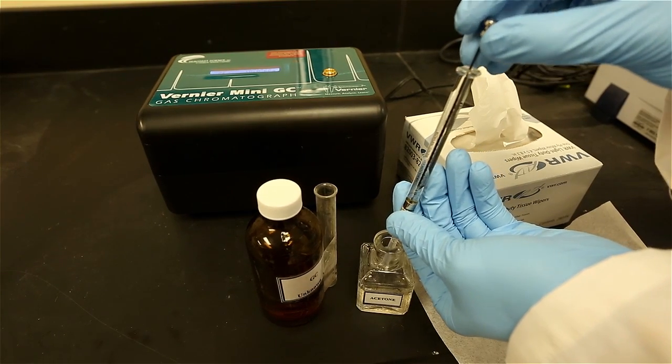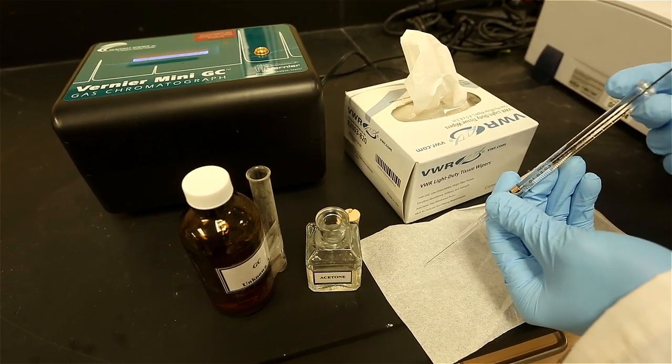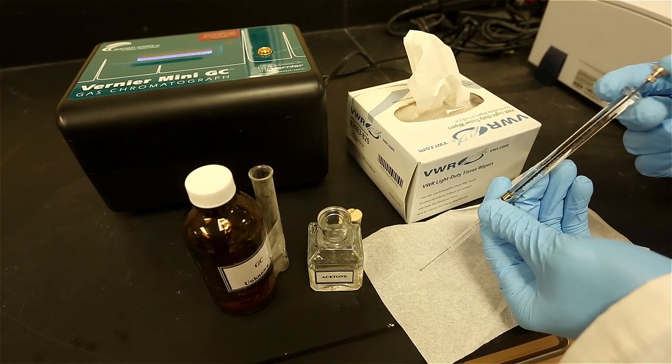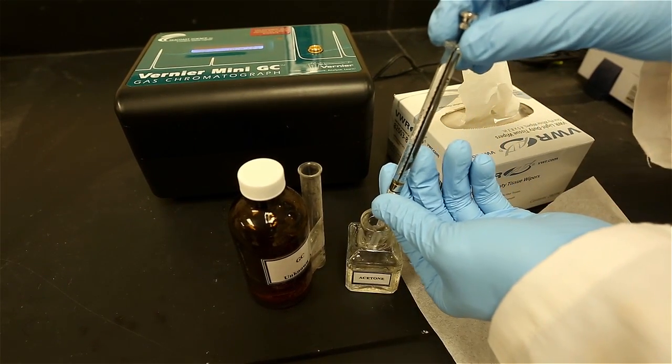Start by cleaning the barrel by filling it one-third full with acetone, then expel on a Kimwipe. Repeat this process two to three times. Never inject water or solids into the gas chromatography instruments because they will clog and destroy the column.